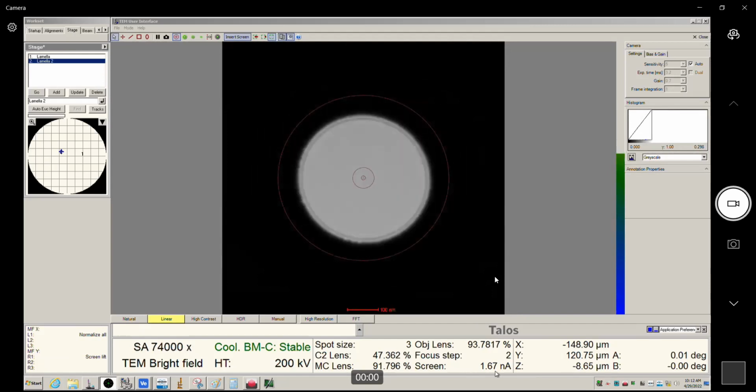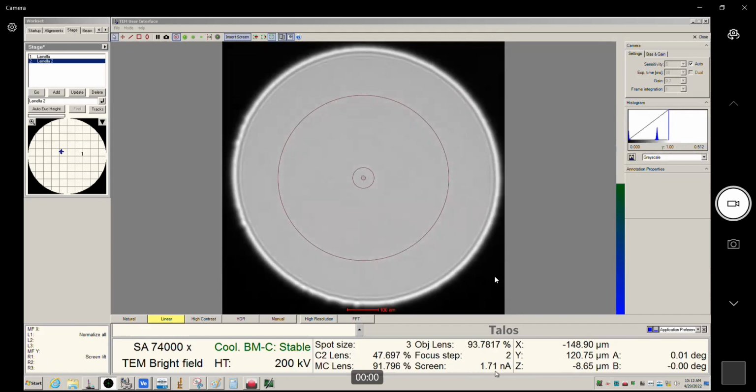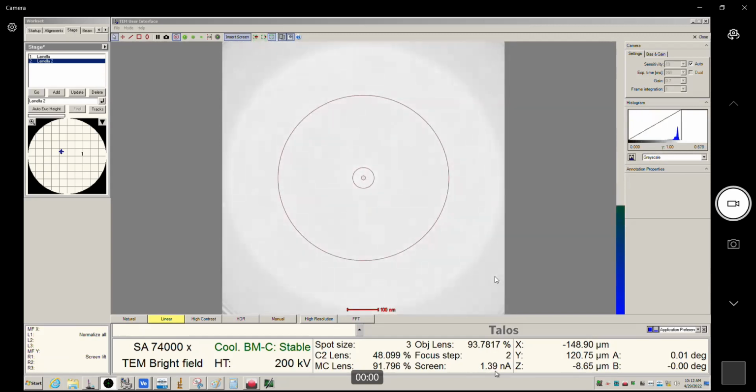Sure. Now, as far as measuring the size of the beam, that is also pretty straightforward. We would never actually use this kind of geometry when we image the sample, so we would expand the beam outside the view field here.